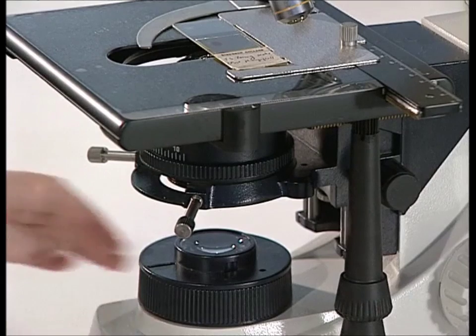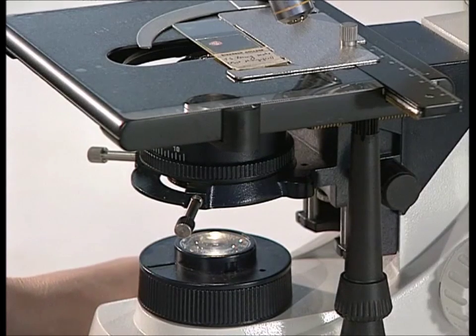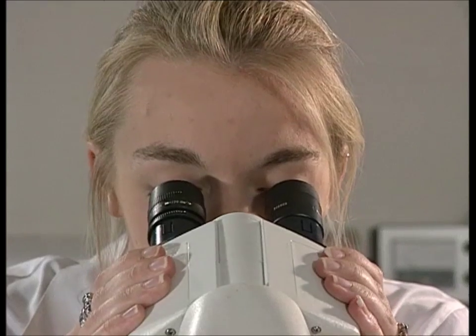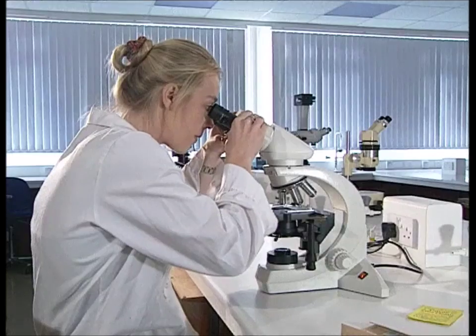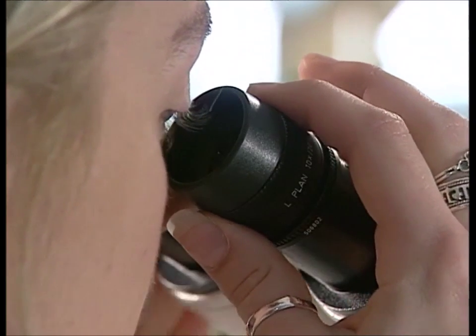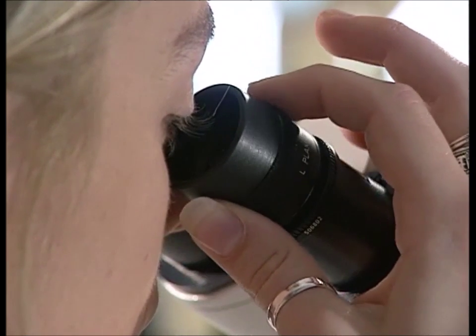Once the power has been switched on, the lamp intensity needs to be set at a comfortable viewing level. Adjust the spacing of the twin eyepieces for your own comfort. One of the eyepieces will have a focusing ring. Adjust it so that a sharp image can be seen with both eyes.